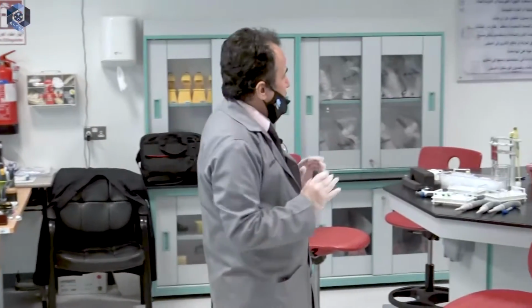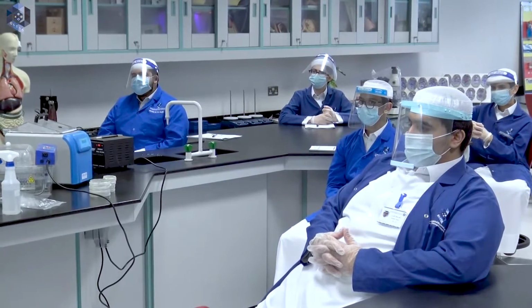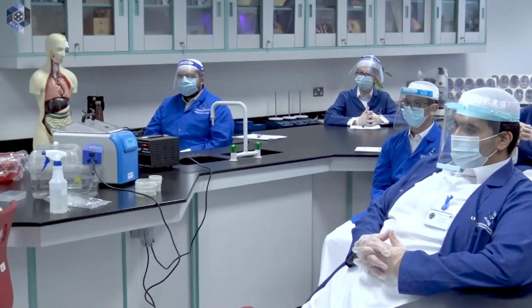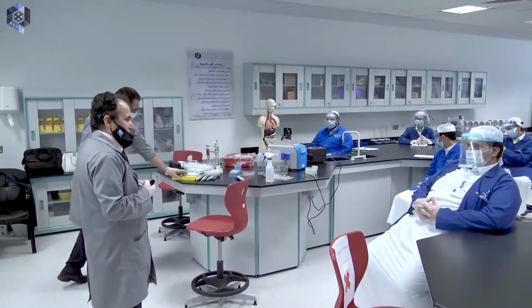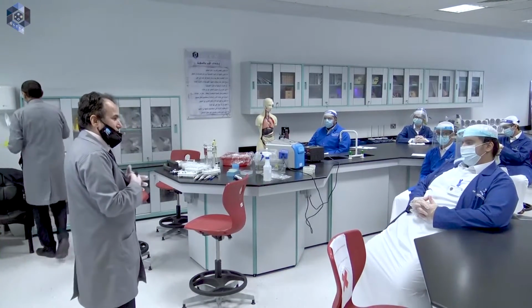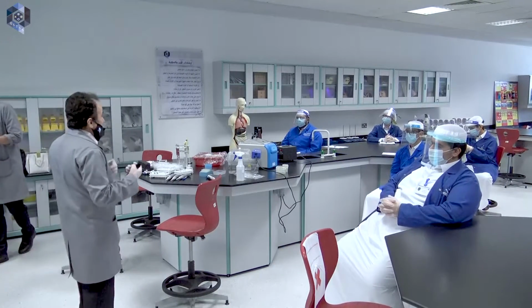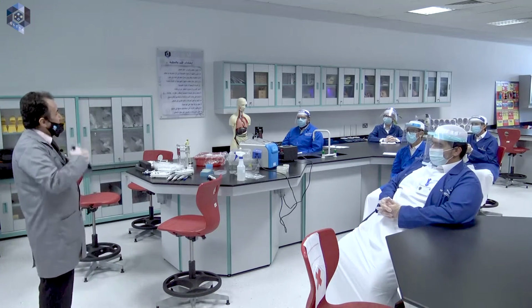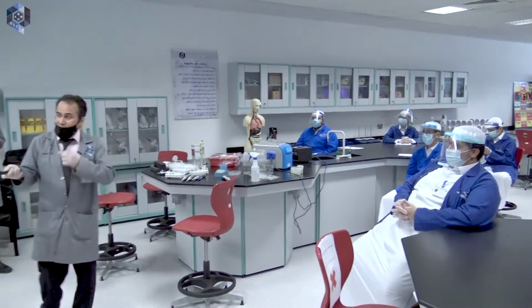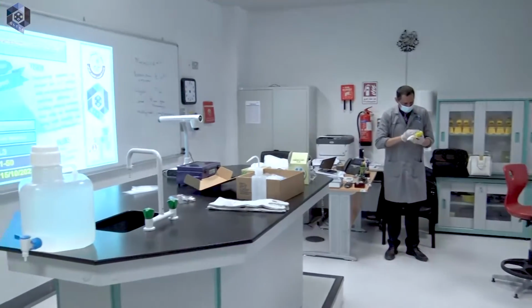Now, it is divided into modules. Today's module is about what, Rashid? Transformation in E. coli. Can you remind us what transformation means? What is transformation? Transformation is when you take one part of DNA. Okay, that's absolutely true. Transformation is when we force a bacterial cell to take in exogenous DNA from outside. This is transformation, okay?